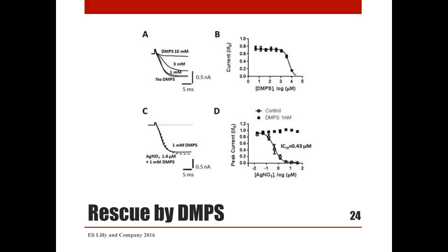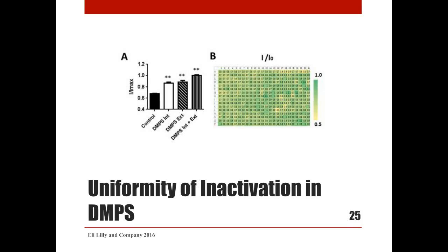We explored the potential for chelation of silver by DMPS, a heavy metal chelator approved for clinical use in cases of heavy metal poisoning. It has high affinity for silver and relatively low affinity for calcium and magnesium. At high concentration, DMPS applied extracellularly blocked N-type calcium currents with approximately 5 millimolar IC50. However, addition of 1 millimolar DMPS to the buffer completely prevented block of calcium currents by silver nitrate without significant effect on N-type calcium currents themselves. Adding DMPS to our solutions reversed the loss of current over the ground electrodes and was most effective when added to both internal and external solution, resulting in uniform distribution of calcium currents as shown in the heat map.